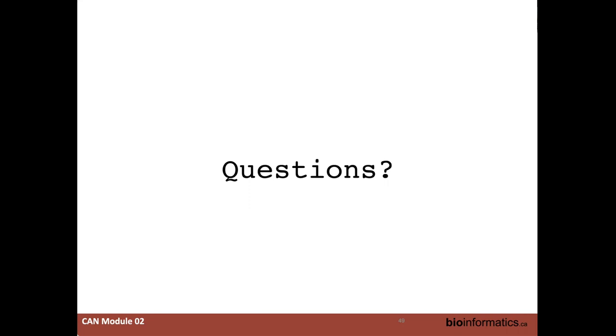I guess just looking at that list, it's hard to figure out where the cutoff of a decent quality is. But it seems to me that the letters are in the range of good qualities, and unless I'm reversing it, the numbers and the characters are not so good qualities. Oh, sorry, I see. So you're talking about the ASCII table itself. Yes. I understand the question now. So if you see a comma, for example, you know how far down the list that is? It's pretty far down there. So when you take a look at something like that, yeah, you can associate it that way. It's funny, I don't even see them as actual legible characters anymore. I just see numbers whenever I look at these things.